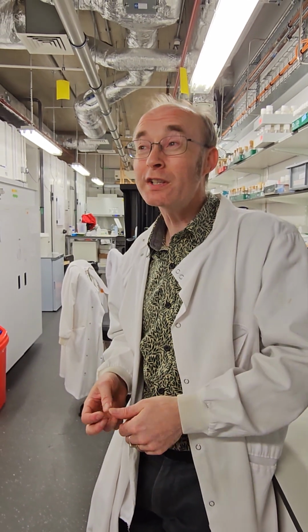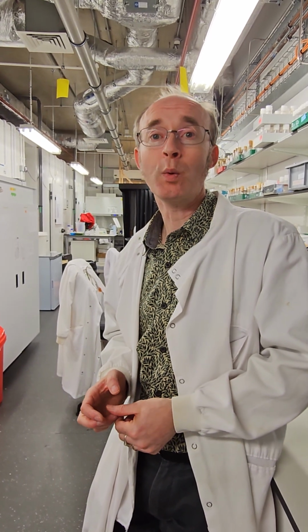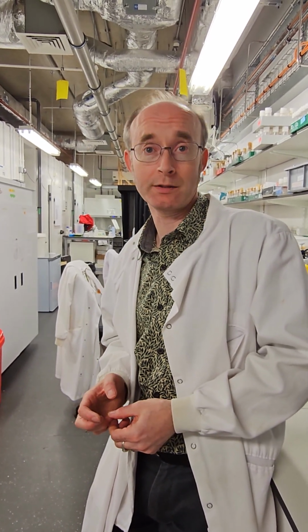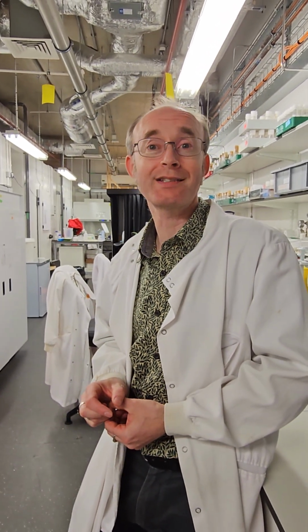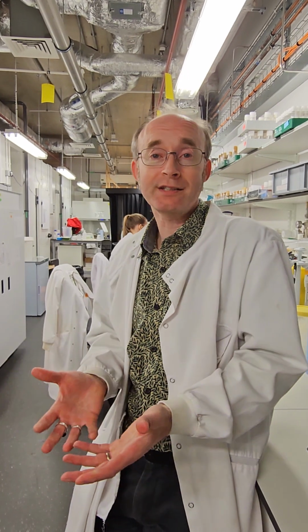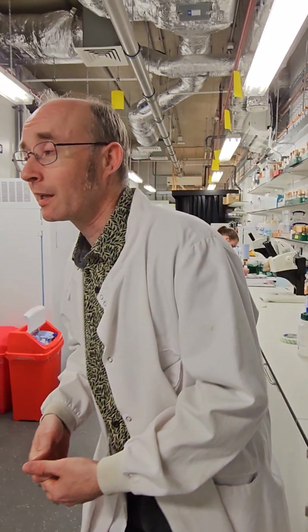And to be honest, most people, there are exceptions, don't have a real problem with experimenting on maggots. But they do have a problem with experimenting on rodents, mice and rats and things like that. So actually, the more experiments you can do using an insect model, the smaller the number of experiments you have to do on mice and rats. That's the way we look at it. That's a very good, valid point.